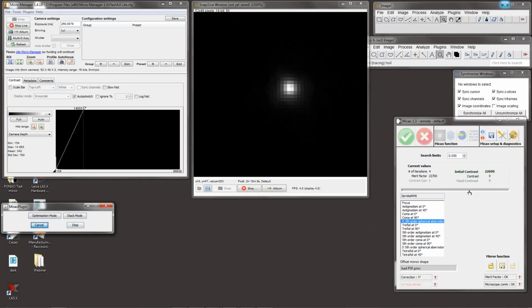Here the process is artificially slowed down. It can be faster. We have a very long integration time, in order to see what is happening, and maybe I should also include focus. This can definitely be faster.